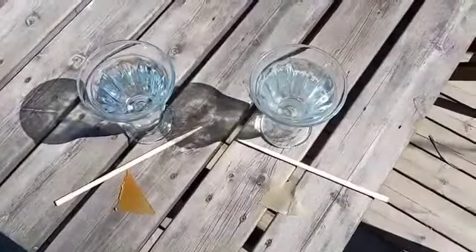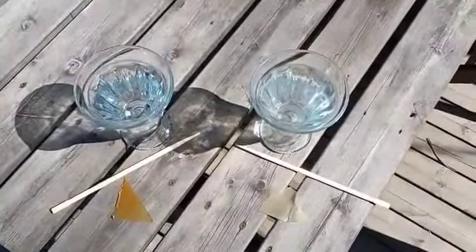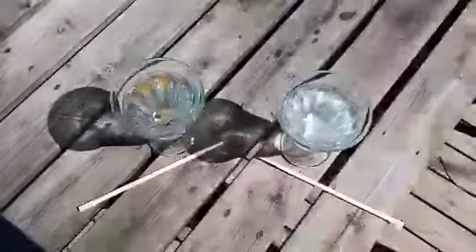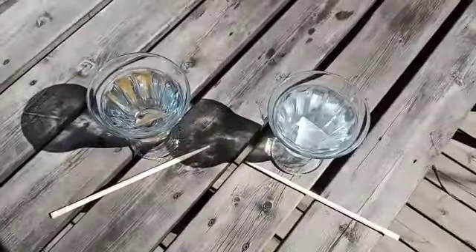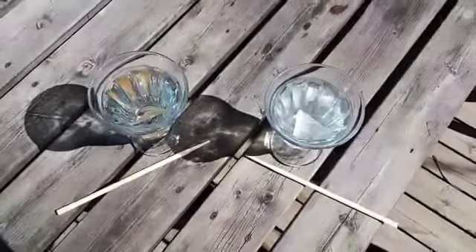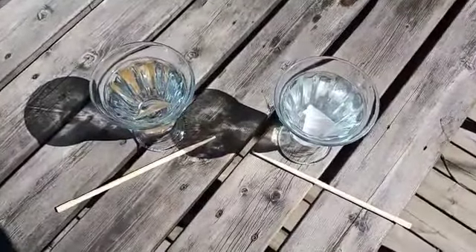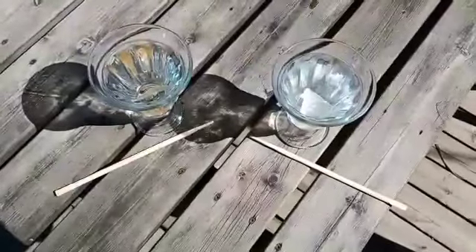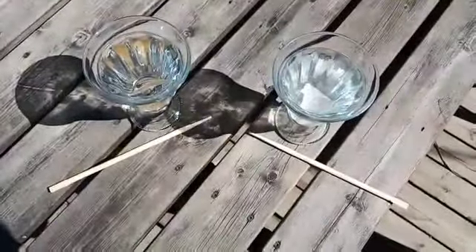The water is plus 40 degrees. Both adhesives sink quite fast into the glasses, which means in principle both have a higher density than 1.0.